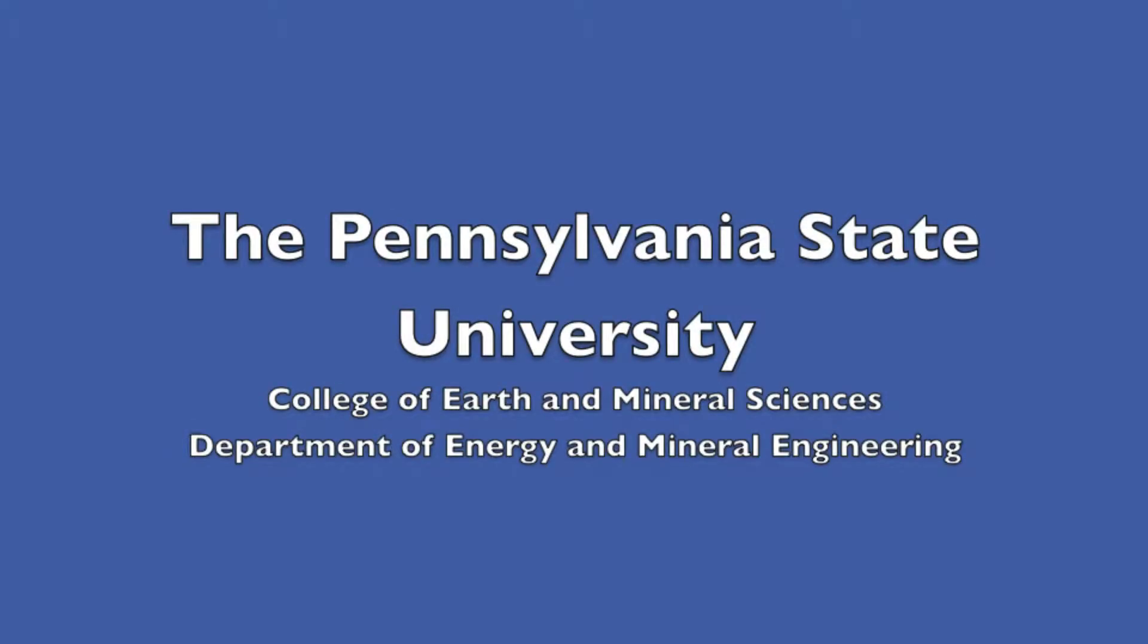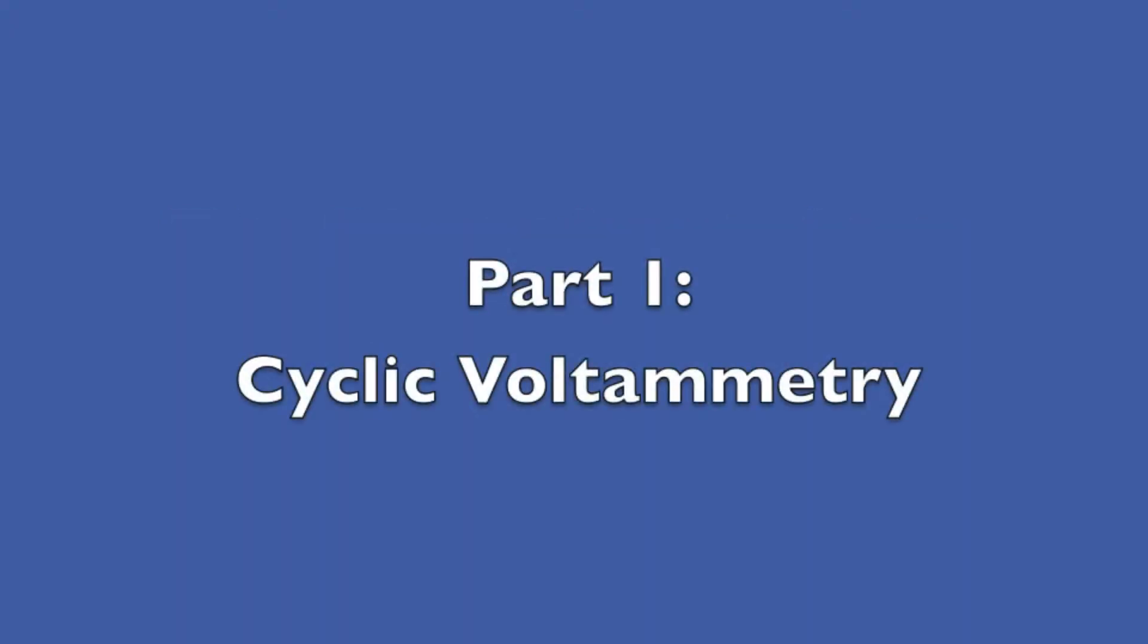The Pennsylvania State University College of Earth and Mineral Sciences, Department of Energy and Mineral Engineering presents the Electrochemical Laboratory Instructional Video for Cyclic Voltammetry and Corrosion Studies Equipment and Materials.